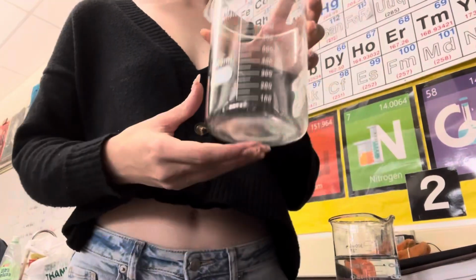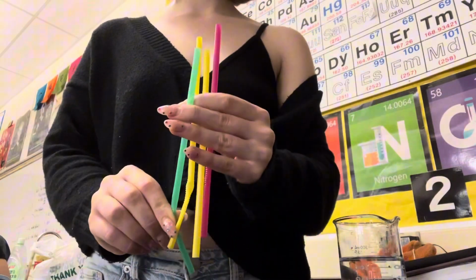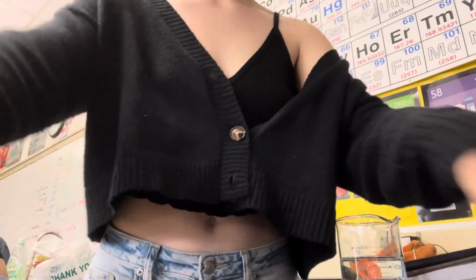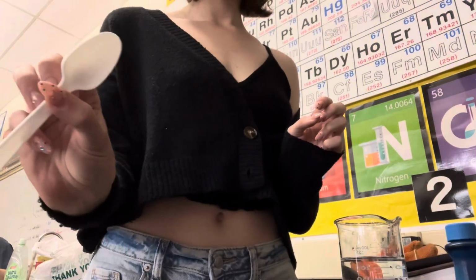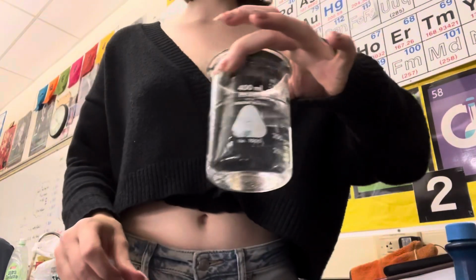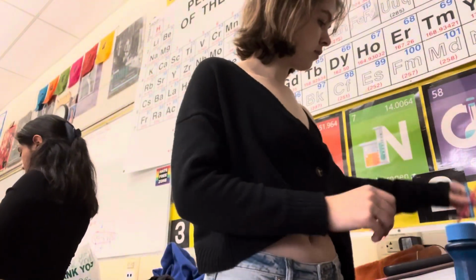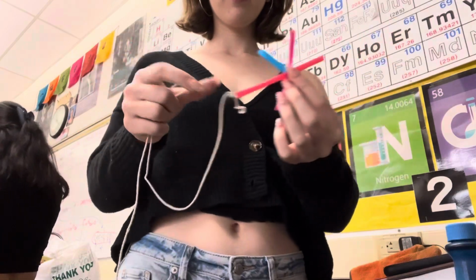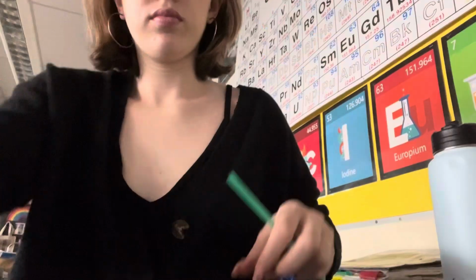For my materials, I used a large beaker, plastic straws, food dye, a spoon, one small beaker filled with 1 cup of water, and string. Also a Bunsen burner and stand to boil the water.